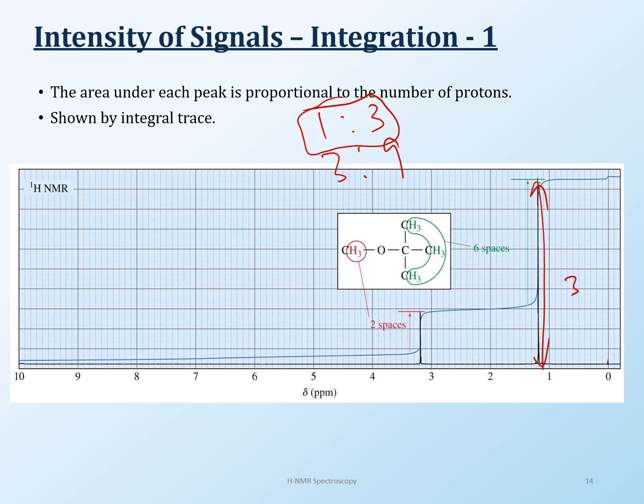So here's what we do in NMR: you can look at the background. This is graph paper. The background can also be plain paper, it depends. But if you have graph paper, all you need to do is count the number of spaces, because it's a graph. On the other hand, if you don't want to do that, you can have the computer do your work for you. The computer does so much work, and there is so much work involved after you have taken your NMR. So what is the computer doing for you? Once you say you want to do integration, it's going to give you this line that you can see right here. This blue line that I'm tracing right now, that's the integration line.